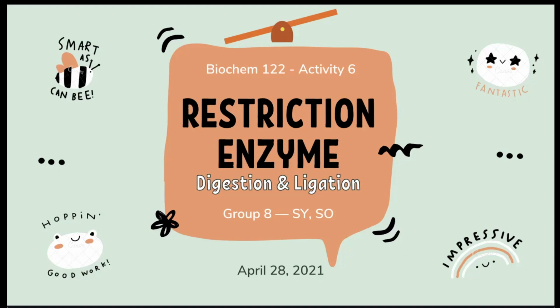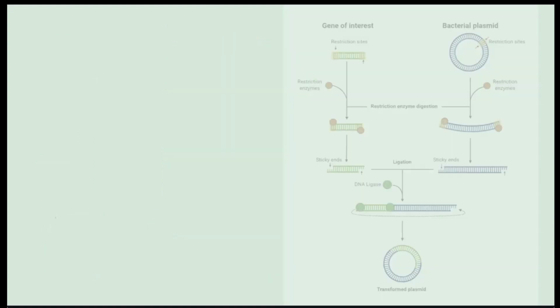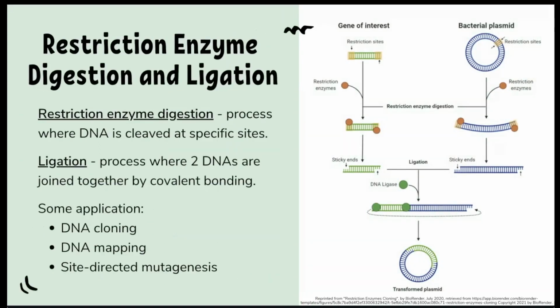Good day, we are Group 8 and we're going to present Activity 6 about restriction enzyme digestion and ligation. Restriction enzyme digestion and ligation are important in genetic engineering, where these two techniques are usually used to transfer a DNA fragment to another DNA.